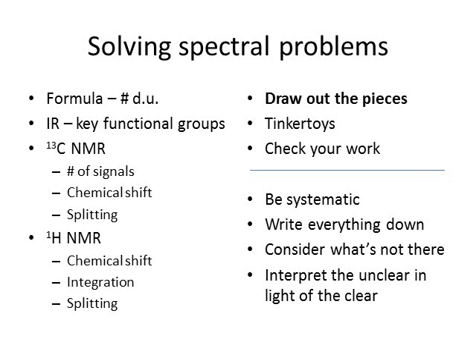Well, then I'm going to go back and check my work. I'm going to go look at the spectra and decide which one fits best. Even if I only came up with one possible structure, I'm still going to check my work and make sure it fits. Now, a couple of other notes in doing this. Notice I'm being very systematic with this.